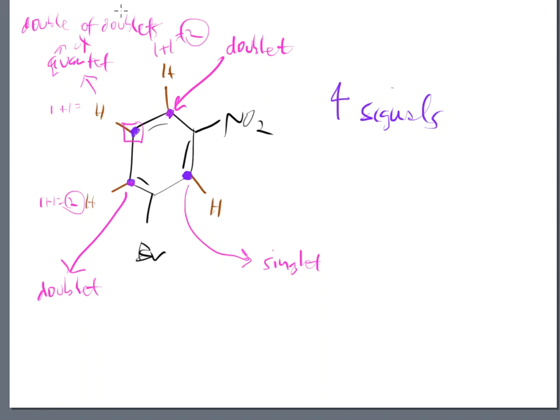So I need to be very specific in some of the terminology that we will begin to use in the NMR interpretation. As with example A, this molecule will give me 4 chemical shifts. One of those shifts will be a singlet, then 2 of those shifts will be doublets, and the last of those shifts will be a quartet, but more specifically, it will be a doublet of doublets, meaning this one will give me those 4 splits that will be about the same height.